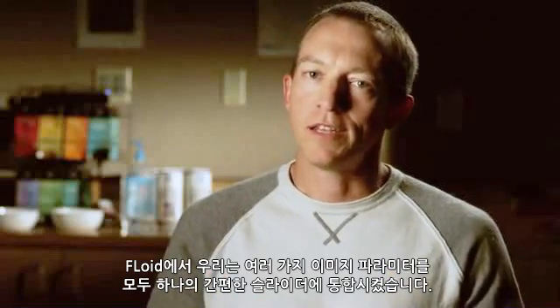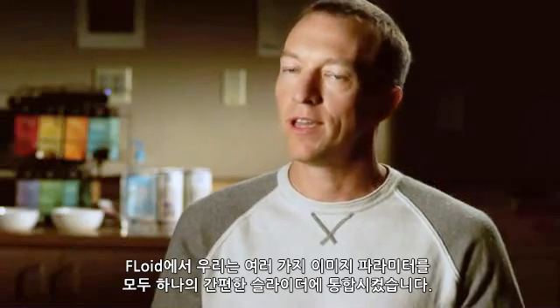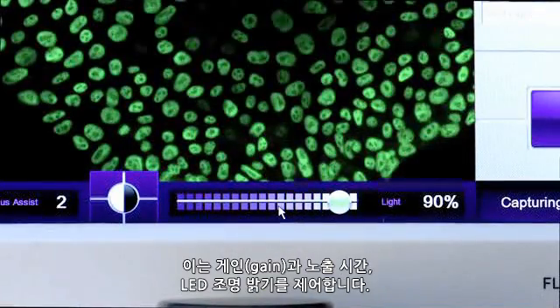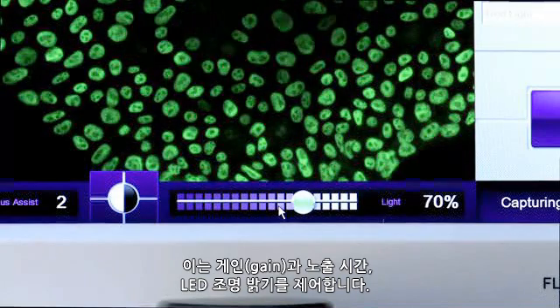With Floyd, we integrated all of the different parameters that control sample intensity into just one simple slider. You move it to the right, it gets brighter. You move it to the left, it gets dimmer. And that single slider controls the gain, the exposure time, and the LED light intensity.